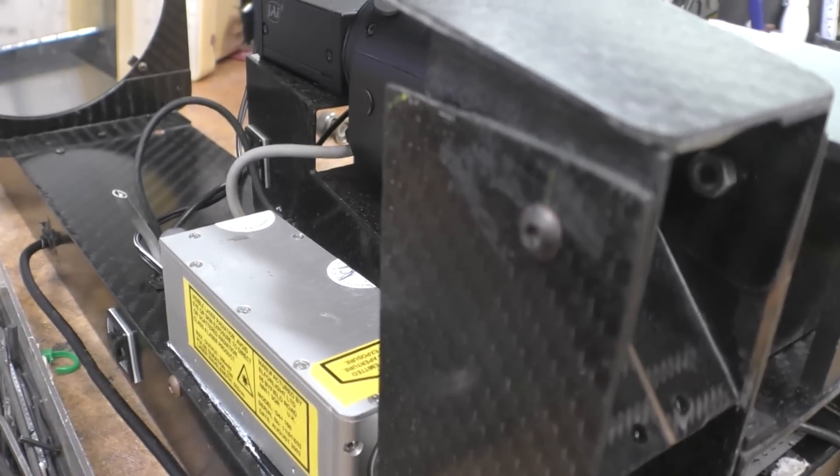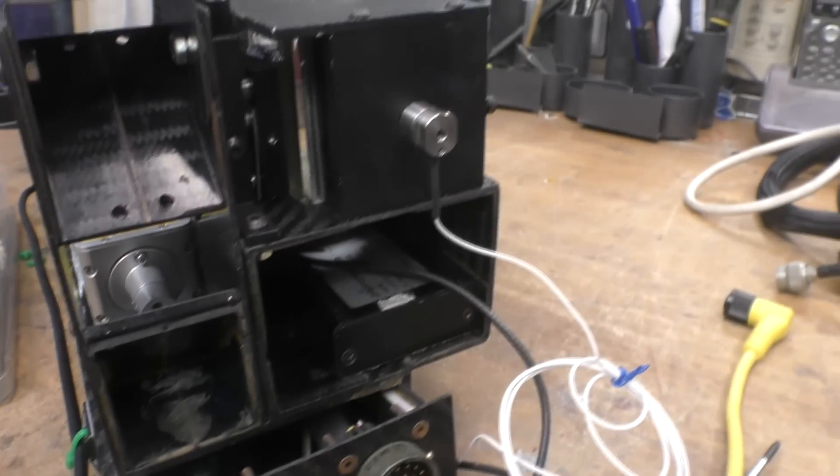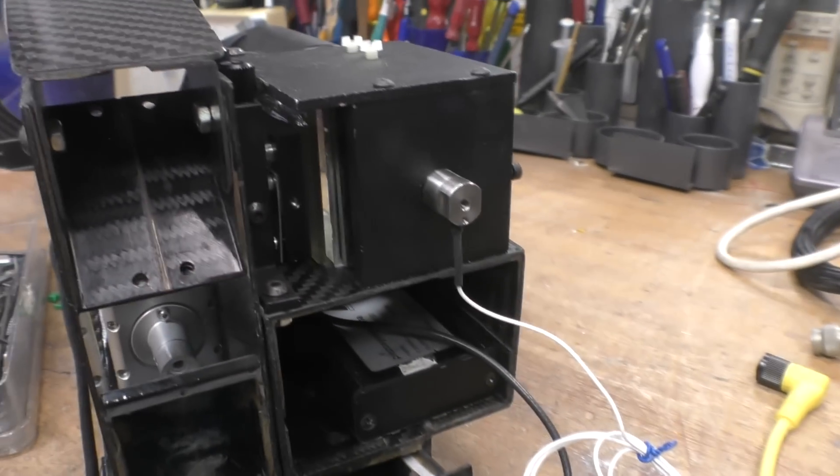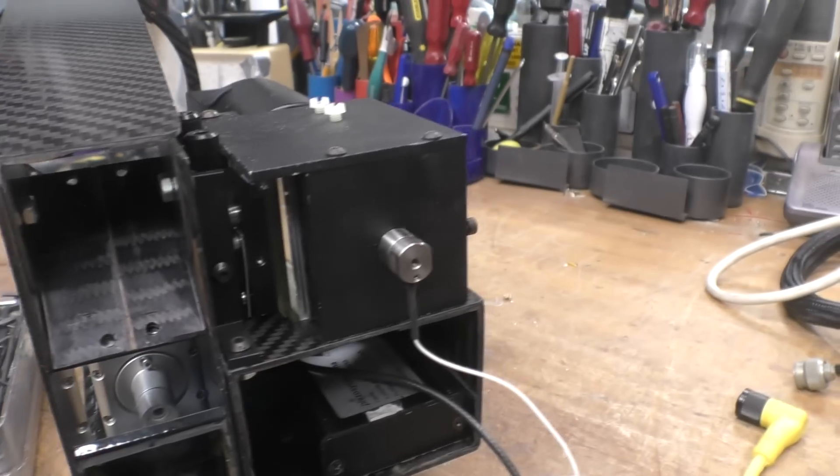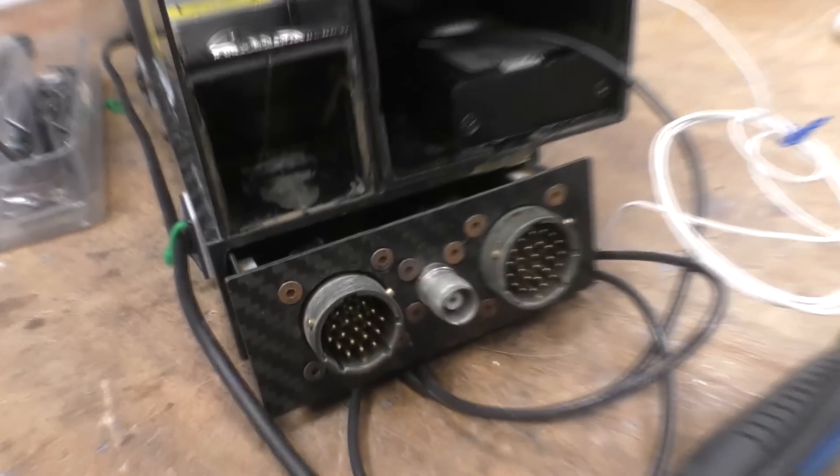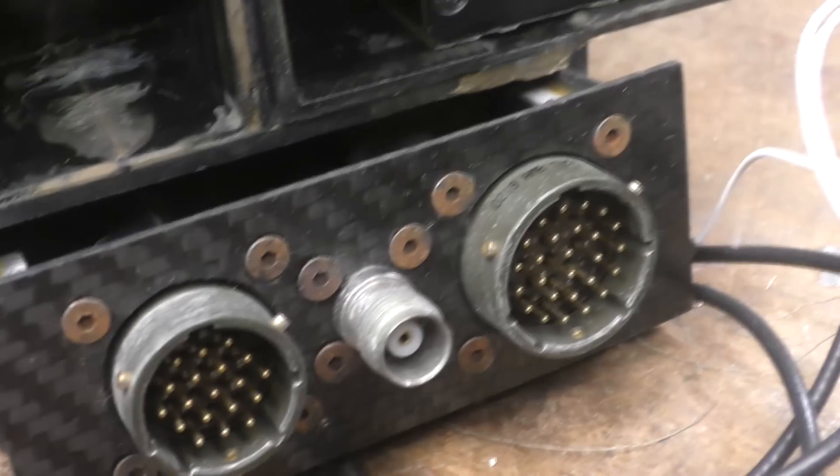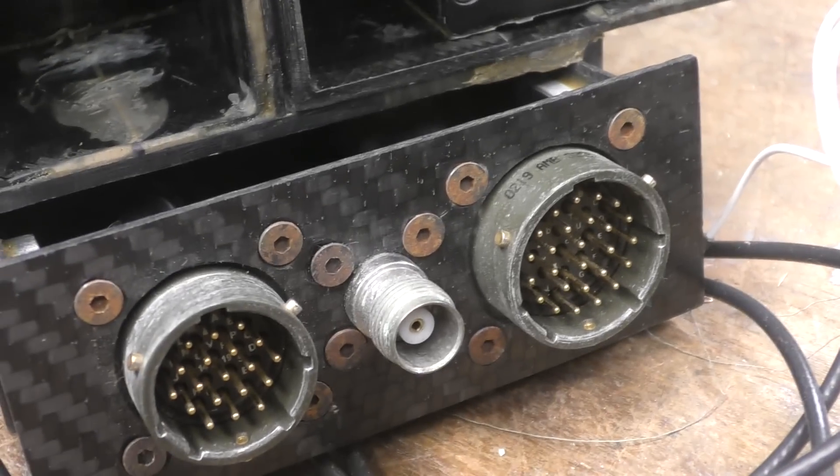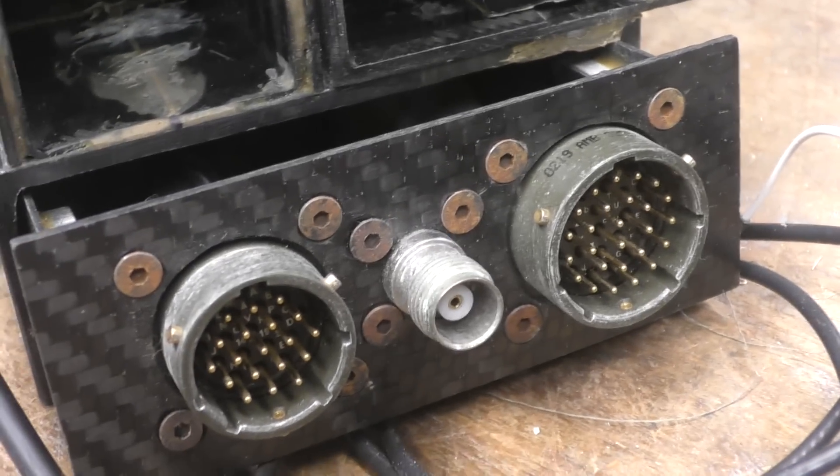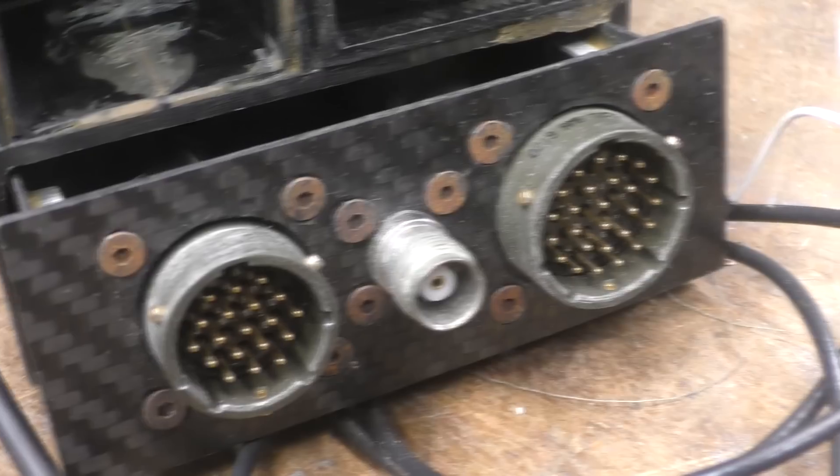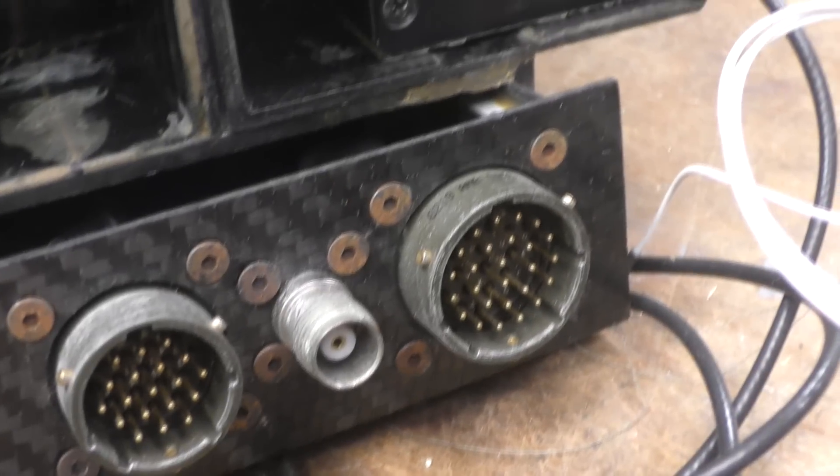As usual for high precision expensive stuff, they use allen head screws all over the place. I can sort of understand if you want some sort of precision fixing or whatever, but just for putting connectors on it's just a pain in the ass - just use normal screws. It's really annoying.